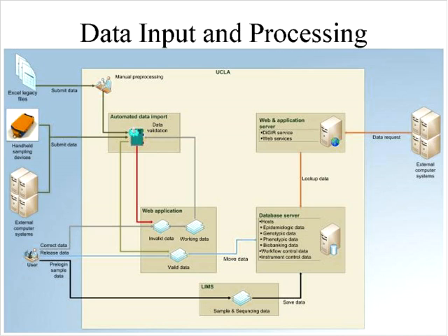Conceptually, the way that this is set up is that we have functionalities that are unique to UCLA that are part of our LIMS system, which here is shown within this beige box and the subboxes within there, which most people who have a complicated laboratory setup where you have a LIMS system would be fairly familiar with this type of integration. The challenge within this environment in terms of integration with the laboratory information management system is that on top of integrating individual pieces of instrumentation the way you would in a normal laboratory, we actually have automated systems which are themselves made up of integration of many different pieces of equipment.